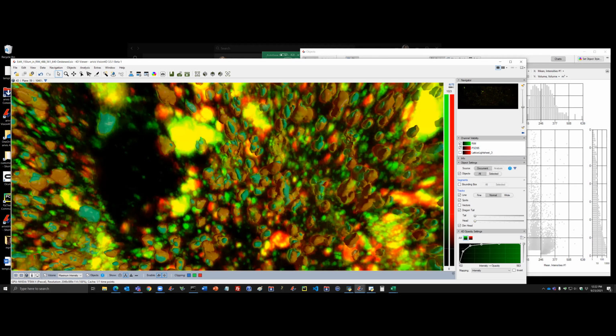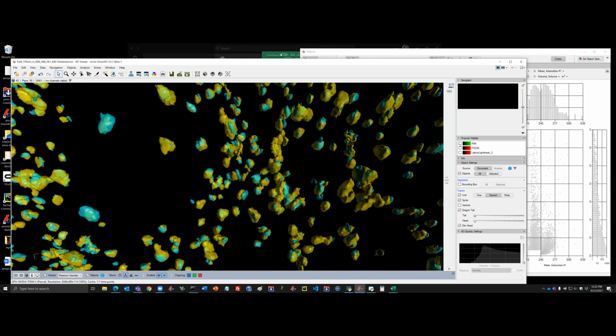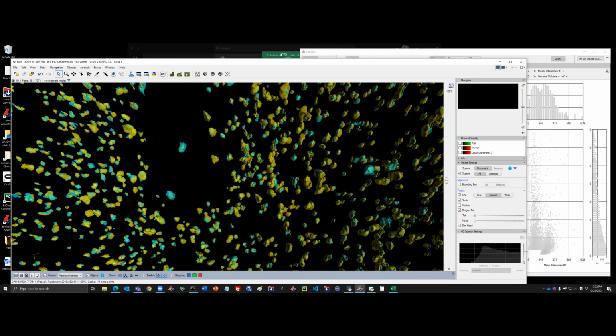We can also interact with each of the channels. We can change the opacity settings from here. And right now in this image, in the navigator, in this SIS file, we are working only with one image stack, but as Molly mentioned earlier, there could be more than one, and they basically contain the whole experiment.